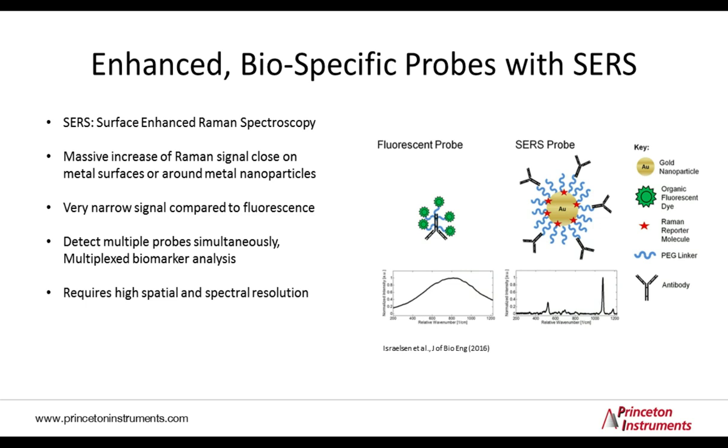Here's another life science application that uses SERS probes to target different biomarkers. SERS stands for Surface Enhanced Raman Scattering. It describes an effect when there's a massive increase in the Raman signal if the Raman active substance is close to a metal surface or nanoparticle. Shown in the figure is, on the left side, for comparison, a typical signal of a fluorescent probe compared to the Raman probe on the right.